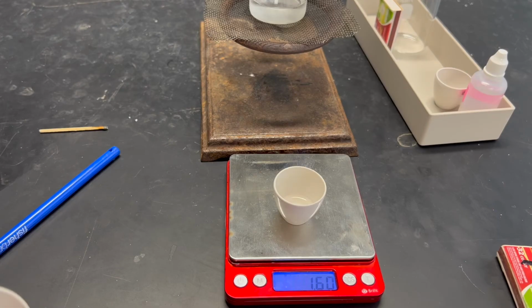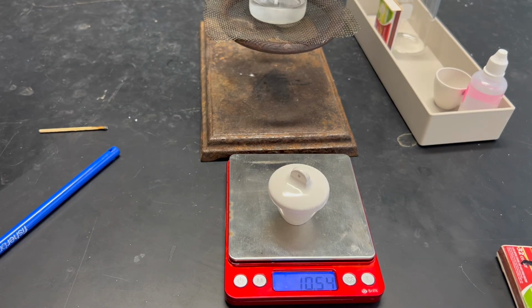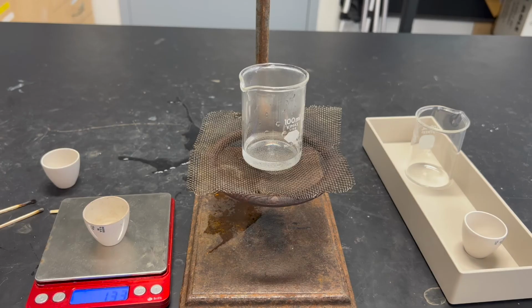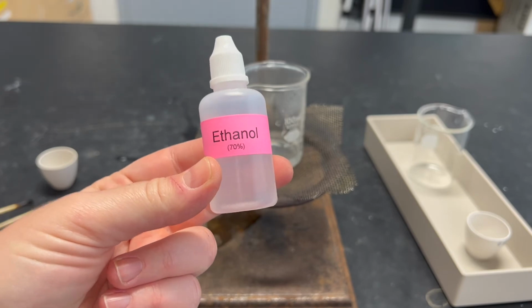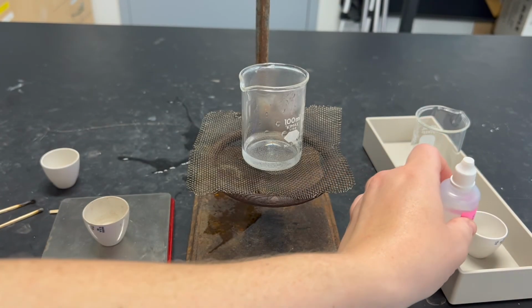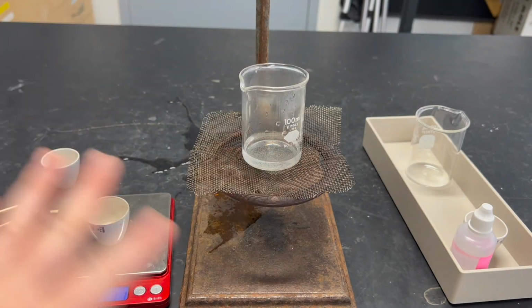If at any point you're having an issue and you need to stop the burn, put the top on, and that'll put out the fire. That is extremely hot, so please be careful touching it. A note about safety. This is highly flammable. When you are done measuring out your ethanol, put it into your tray and push the tray all the way away from your setup here.